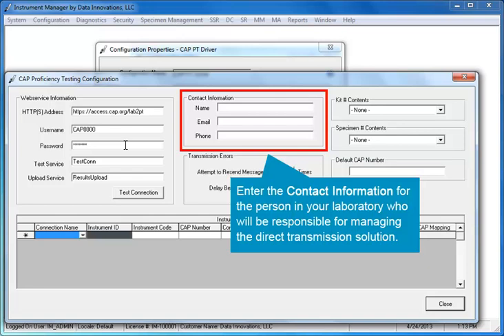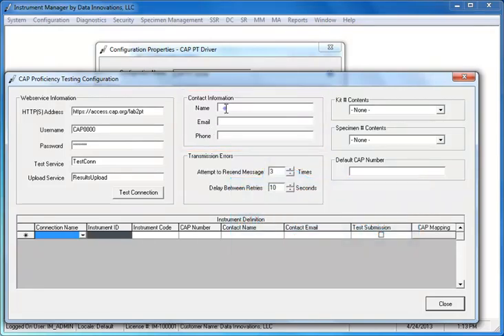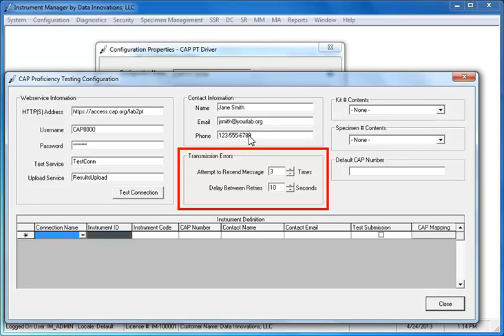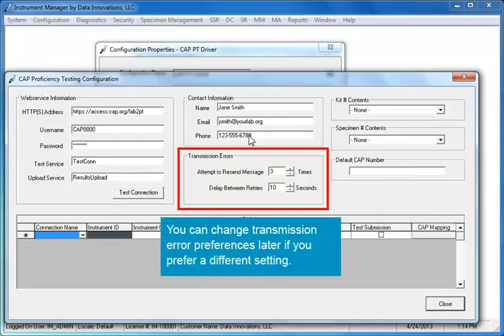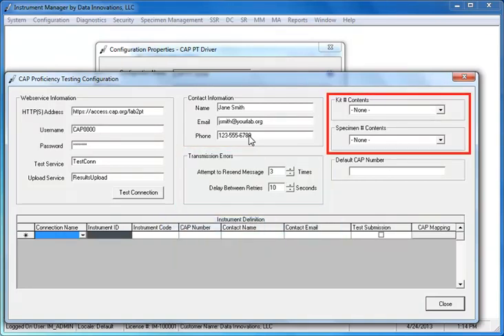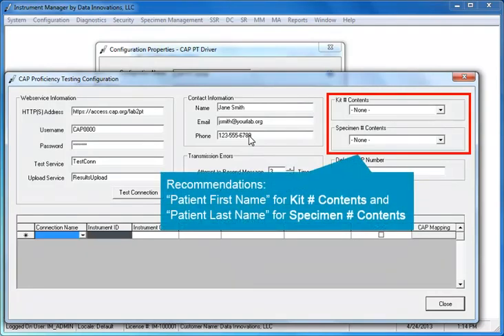This includes the name, email address, and telephone number. The CAP's user guide recommends using patient first name and patient last name, respectively.